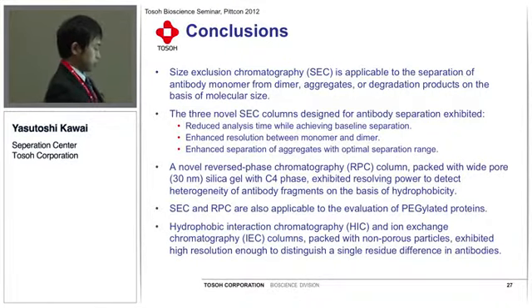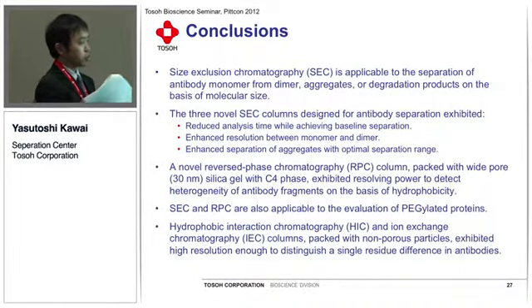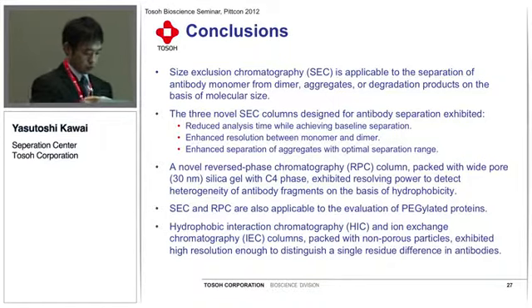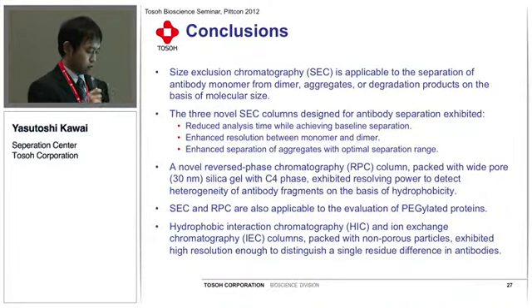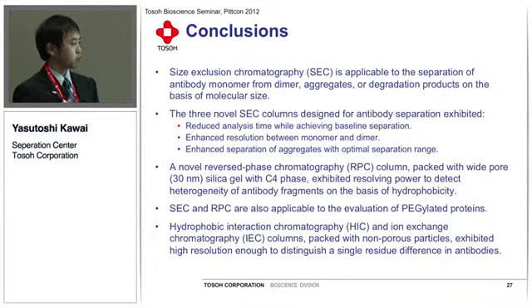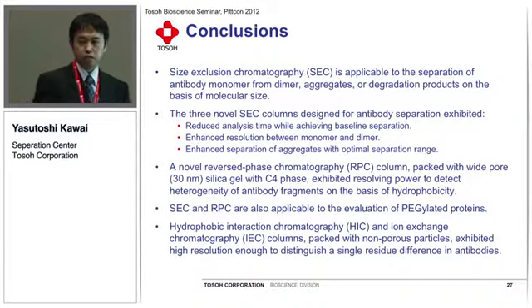Second, I displayed the separation studies by reverse phase chromatography. This RPC column is packed with wide pore C4 material. This column exhibited resolving power to detect heterogeneity of antibody fragments on the basis of hydrophobicity.